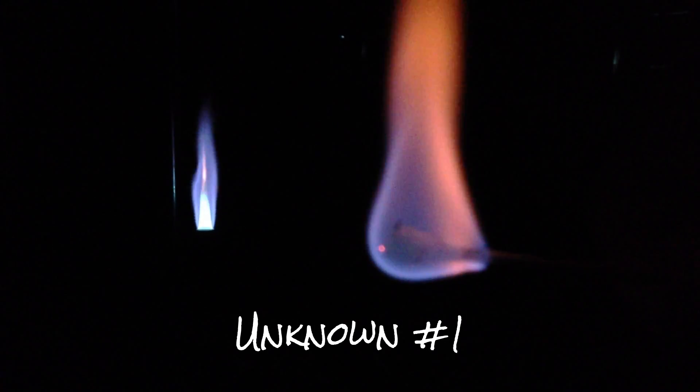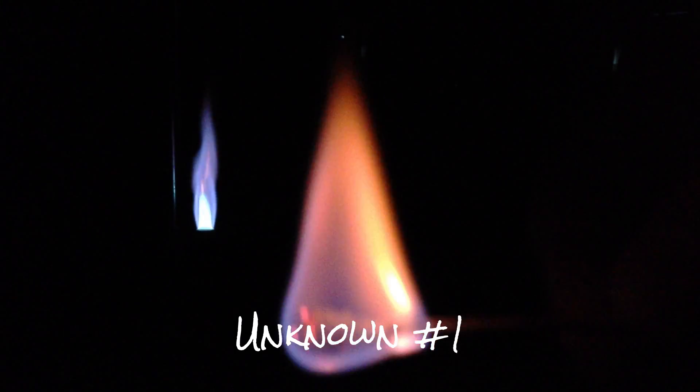Now I also have some unknowns. I have two samples — unknown number one and unknown number two — both from the previous six elements, so see if you can identify which ones they are. Getting some methanol on here and dipping it into my unknown one sample — there's my first sample. What chemical burns with that unique light? And then last but not least is sample two — and there's our unknown number two.